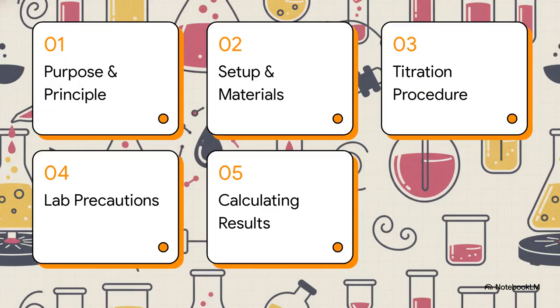Here's our game plan for today. First, the purpose and principle. Second, our lab setup and materials. Third, the titration procedure itself. Fourth, some crucial lab precautions. And finally, calculating our results.